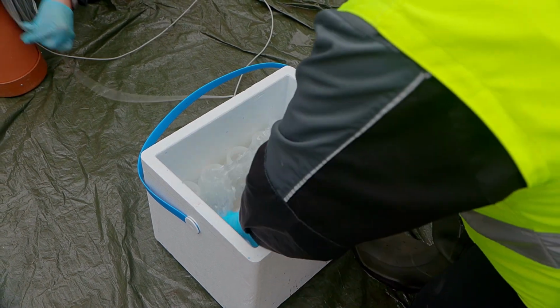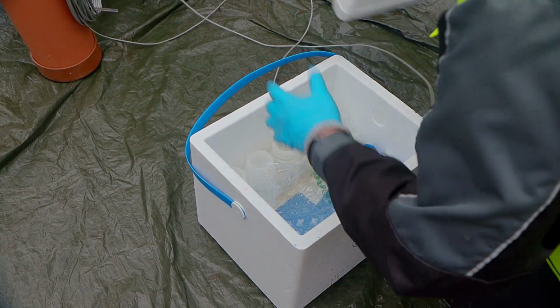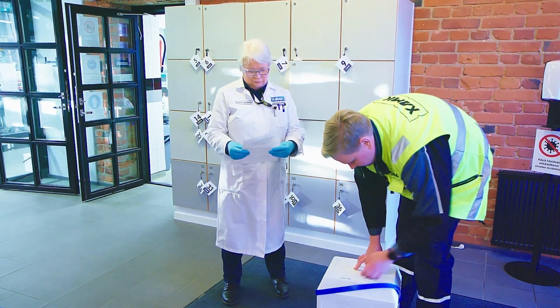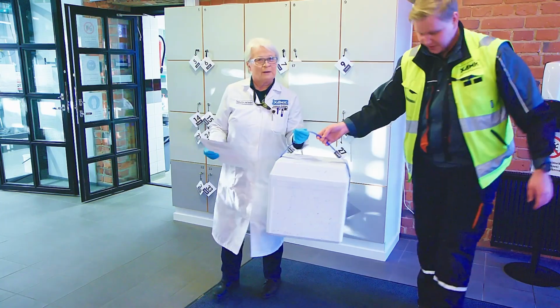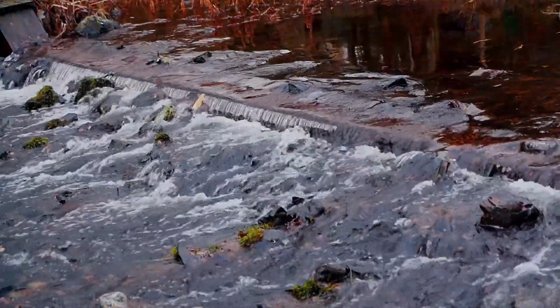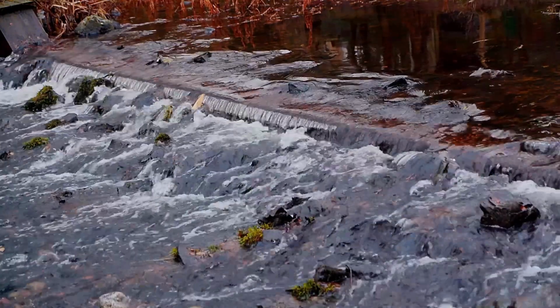The nature of sampling can therefore vary greatly depending on where the samples are taken and how they are analyzed. It is therefore important that the sampler knows the aim of the study and uses the right methods in fieldwork. As their name implies, field meters are instruments carried by the sampler to the field that are easy to move from point to point.